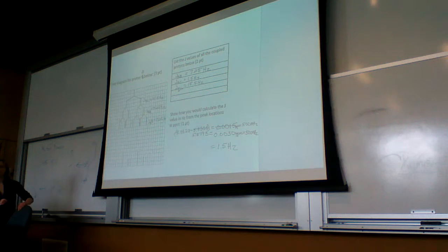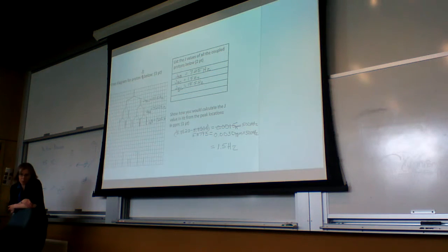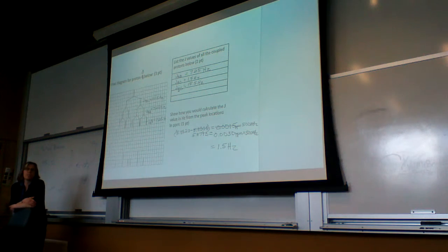If the VA coupling, they wrote 5... Sure. Okay, but no, if you're looking at that one, there was the 14.5 value, but that's twice the coupling. And you would see from the other peak that there was a 7.25, not a 14.5, so you know it's 7.25 for the coupling. But it's a triplet because there's two of them.